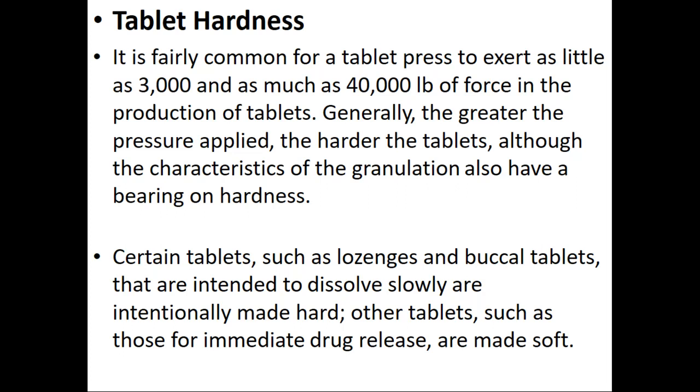Although the characteristics of granulation also have a bearing on hardness.